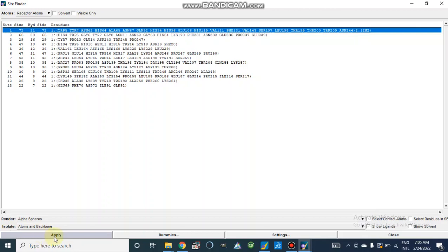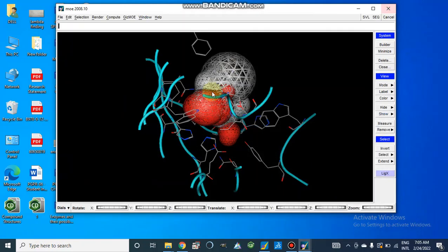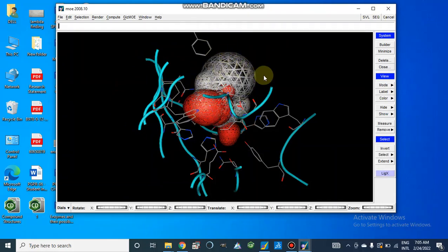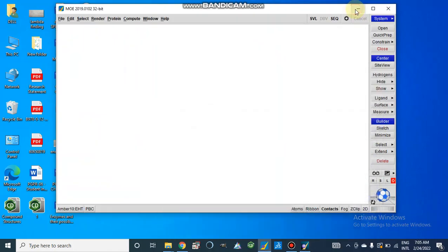By this, we will only isolate our atoms and backbone of the active site. And this is our active site which contains alpha sphere. In this way, we can obtain our active site.